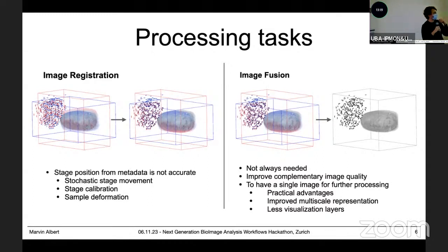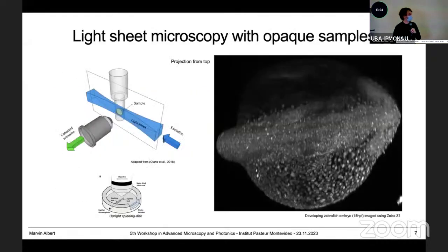But sometimes you do want to do that, for segmenting different types of structures at different scales, and also in the case of light sheet imaging that I want to quickly speak about. That is a very common use case for this that I think Lionel was speaking about yesterday. So, if you remember light sheet microscopy, which is very good for imaging large specimens, and is very common not only in cell biology but also in developmental biology.